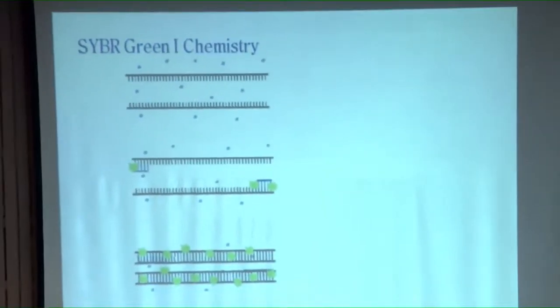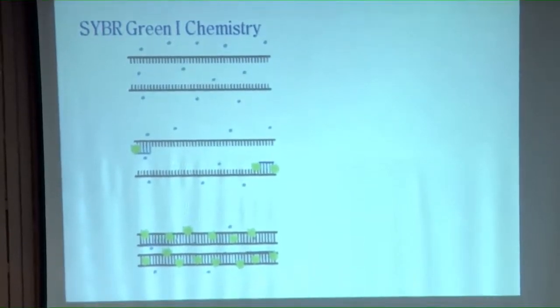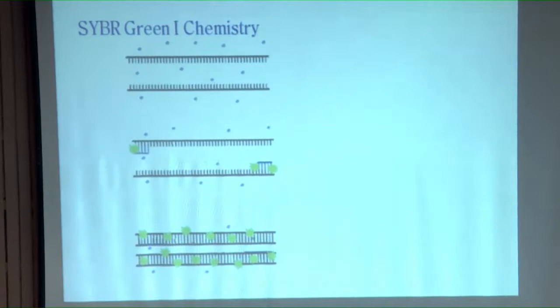You pay attention to this couple of slides. It's coming here: the principle behind SYBR Green-based qPCR. This is very important. At the start of the reaction, you have a template DNA, which is by and large double-stranded DNA, right? And you have all other ingredients, and you added the dye here. At the zero time point, you have everything together.